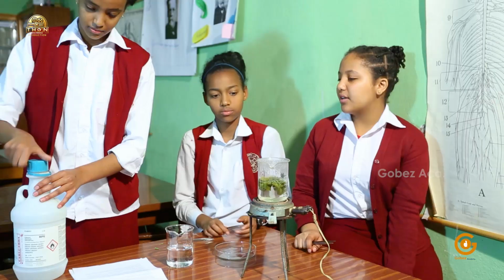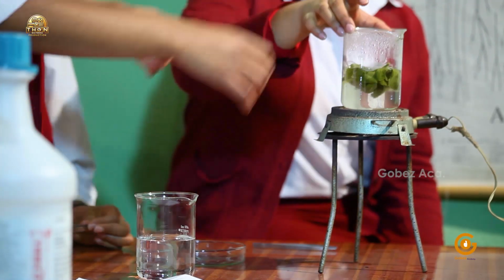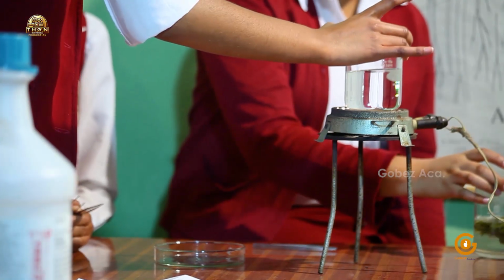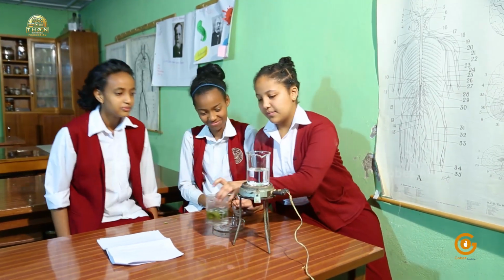So never heat ethanol on an open flame. Do you know why? Well, I think it's because ethanol vaporizes at a lower temperature than water, making it easy to catch fire, isn't it? Yes, you're right.